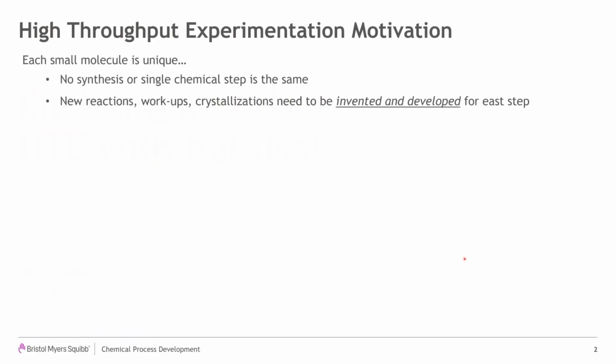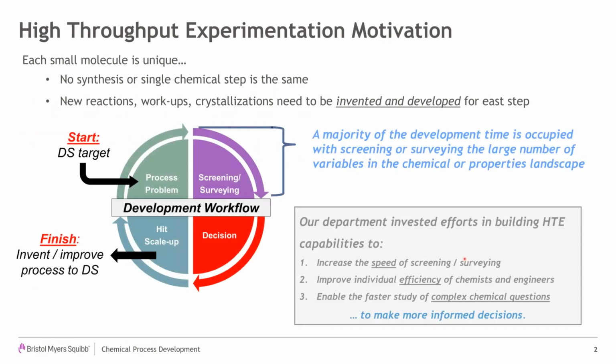I don't really need to go into the motivation for why we'd want to build up this capability, but very briefly, it's to accelerate timelines and deal with the more complex molecules that are coming into our pipeline.